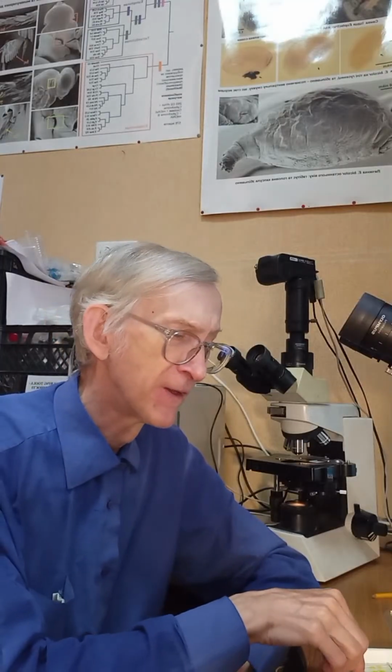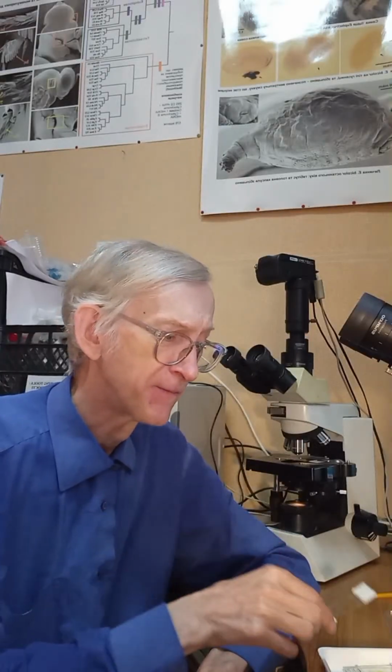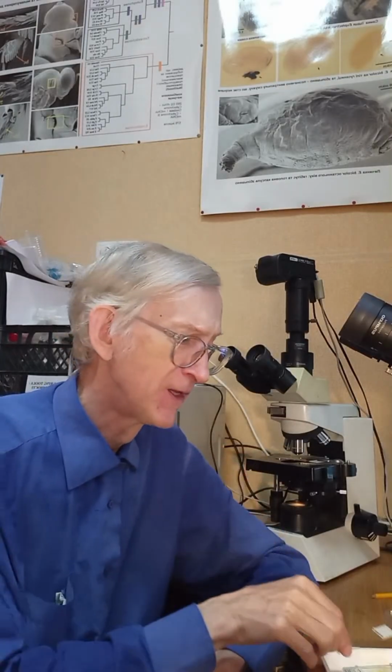That's why from time to time I need to take photos and make microslides of different samples to check what is inside the sample. With the naked eye you cannot understand. The insect is very small, 0.5 millimeter. But under the magnification of 1000, I have the opportunity to identify the species name, either Trichogramma pintoi or Trichogramma evanescens.